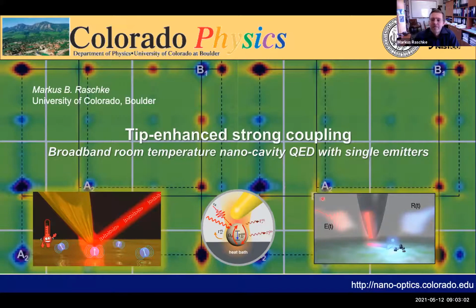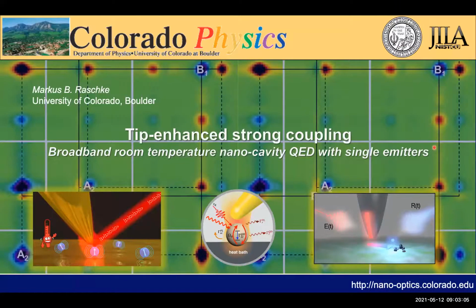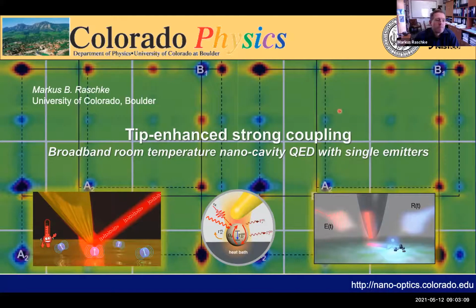I will be talking about a new dimension in optical nano-probe imaging and spectroscopy, where the scanning probe tip, which in conventional tip-enhanced and scattering-type near-field imaging interacts with the material weakly, so we have weak optical and small perturbations. What I will discuss is an area we have entered only very recently, where we can localize and take advantage of this tightly confined near-field light-matter interaction to drive the system into a light-matter hybrid state based on this nano or pico-cavity.